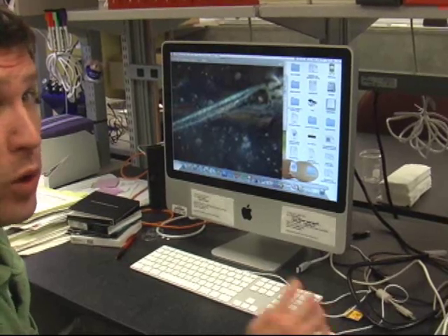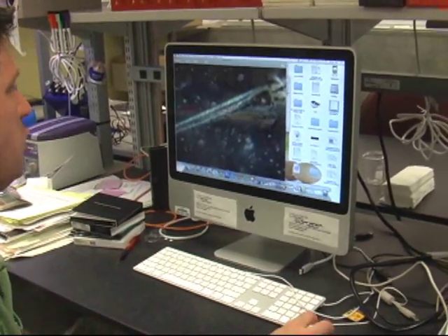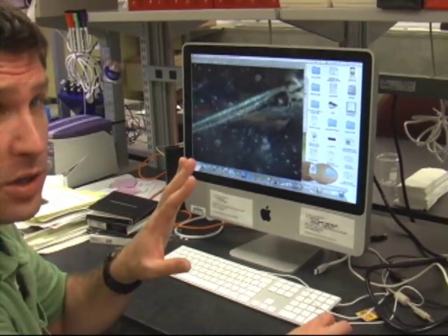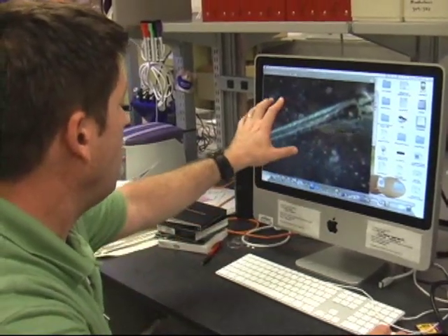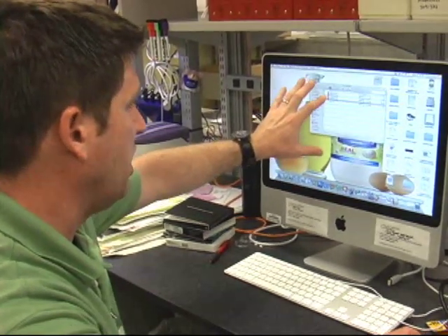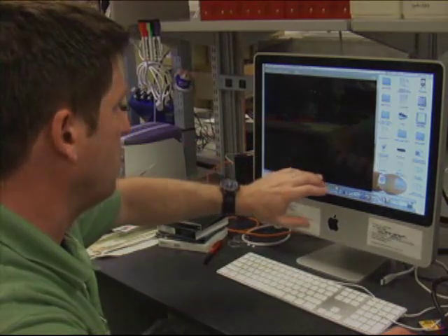When we take pictures that are for our actual images, we want clean water. We'll use a glass depression slide, clean it up, take the picture over here, and make sure we've got the shot we want — otherwise we need to keep taking them, because the embryo is getting older.